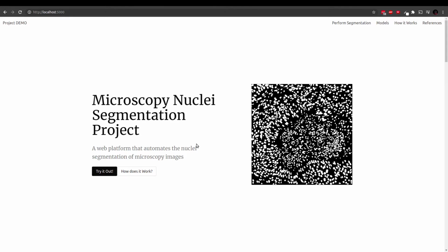As I've explained it so far, it seems like a very hard and troublesome thing to do. So with deep learning, we can actually make this easier and a lot less, or let's say no labor at all in the process of trying to get this. The proposed system that we have right now basically takes an image that the scientists will upload, which they will take to their microscope as usual, and the system will then feed it to the required neural networks and generate the expected output, as shown here by this image of an example.